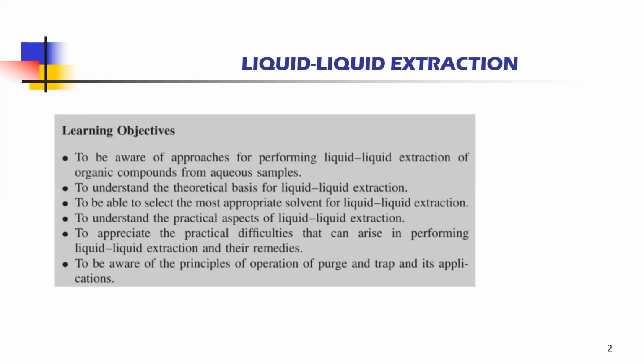And the last point is to be aware of the principle of operation of purge and trap and its application, which we are going to see when emulsions are formed. So let us begin with liquid-liquid extraction.